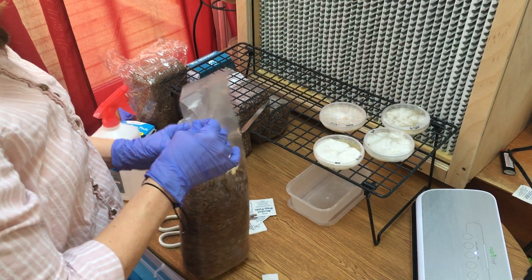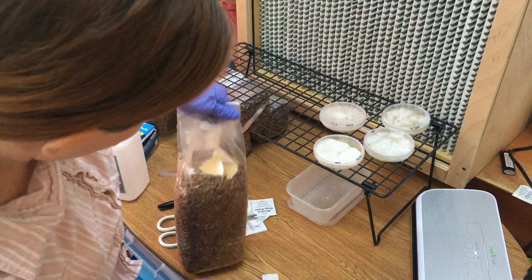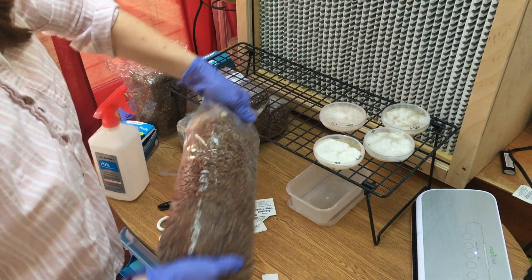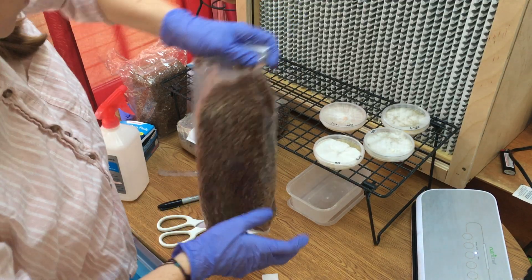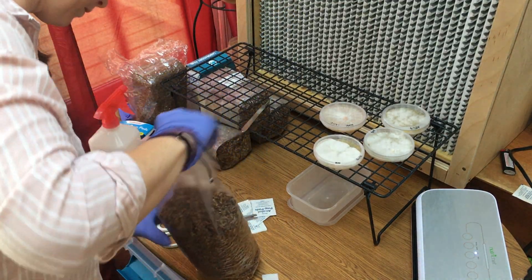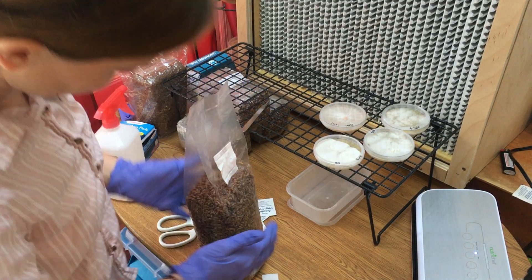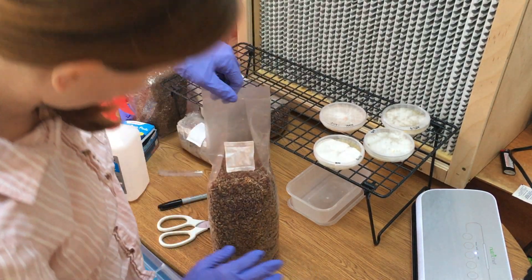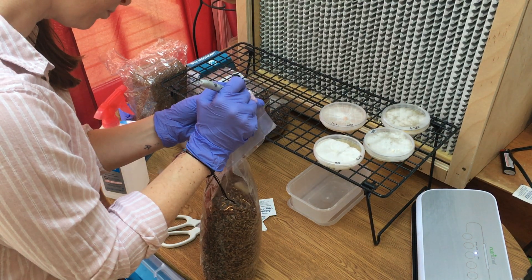Finally, give the bag one last mix, trying to mix all of the agar wedges inside of the grain, covering all of them. Looks good. And then don't forget to label your bag. Thank you guys so much for watching. Bye.